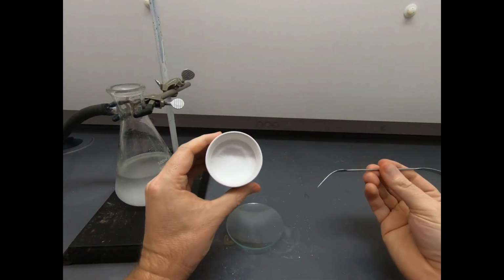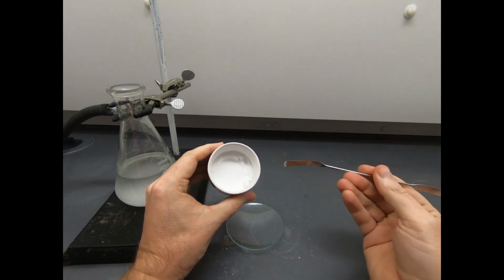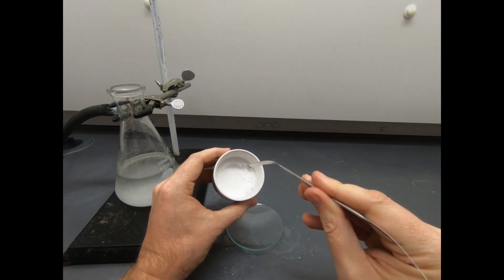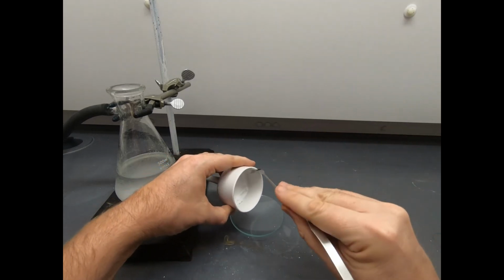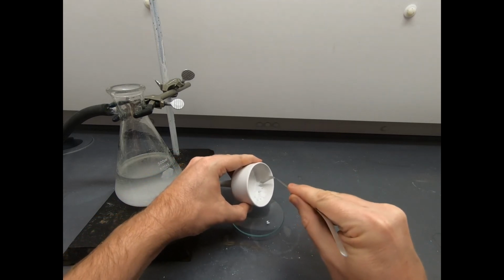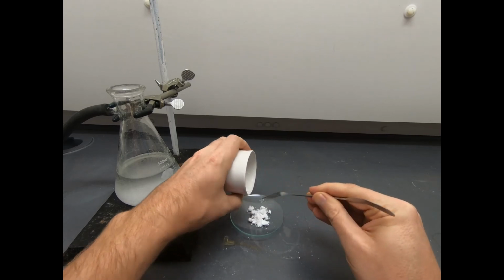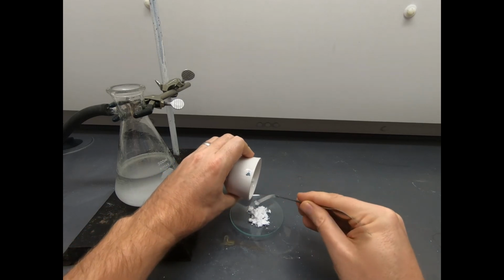we're going to, I don't know if you can see, there is solid in there, and it's pretty flaky. When I remove this solid, I'll probably bring the filter paper along with it. So that's just something to be mindful of. We will have to remove that filter paper. That looks beautiful. Scrape it around the edges.